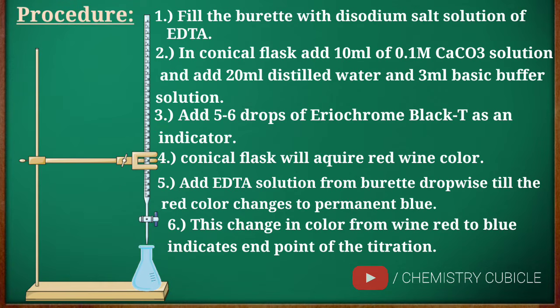We know that 2 solutions are generally used in every titration, where the strength of one is generally known. The solution to be titrated is taken in a conical flask by using a pipette of 10 or 20 ml. In this case, we have to take a metal salt solution.